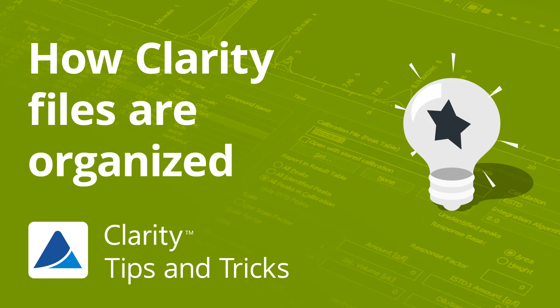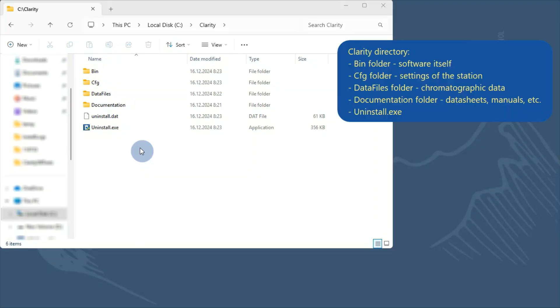Hello, in this video I will explain where Clarity files are stored and how they are organized. Let's start with the folders in the Clarity directory.